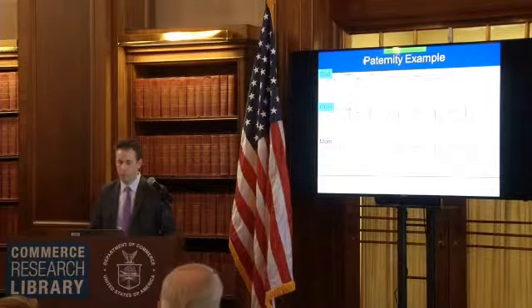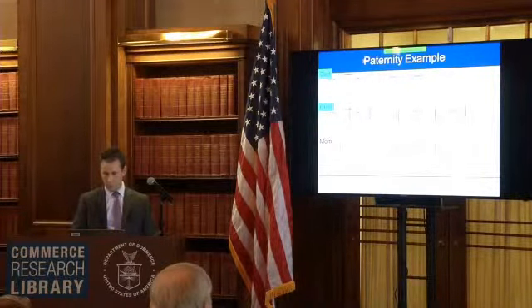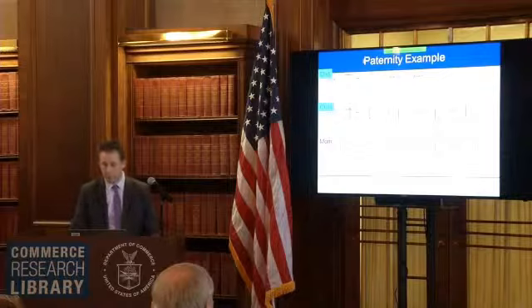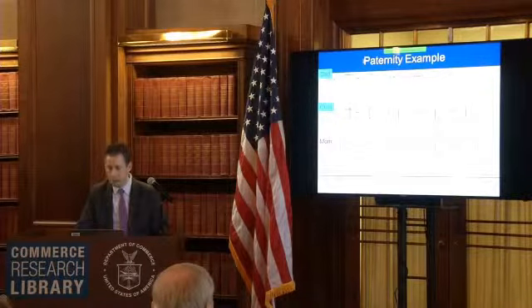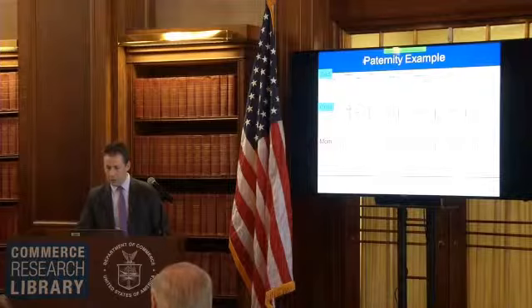Because I almost look at the 11-12 in the child, I almost want to say they're 11-12, but I see it's low enough that you probably just say that's noise in the two child peaks here? Yeah, exactly. Looking at that, you have the dad as 11 and 12 and the mom has 12 and 13, when you make a call that that would have been 11, 12 in a child, where the 11 came from the dad and the 12 came from the mom, as an example. Right. Yeah, I can see what you're saying.